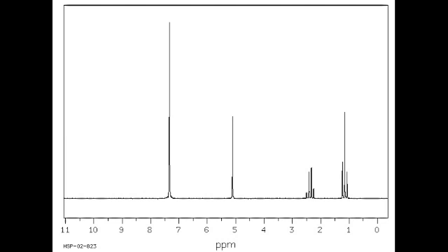Whereas downfield, we see a singlet at 5. So what I'm thinking for that singlet at 5 is, maybe that's next to an oxygen or an aromatic group or both, and no other hydrogens, because that'll always give you a singlet if you have a carbon bearing hydrogens that's next to no other hydrogens. So that's what I'm thinking for that one at 5, just without looking at the molecule.